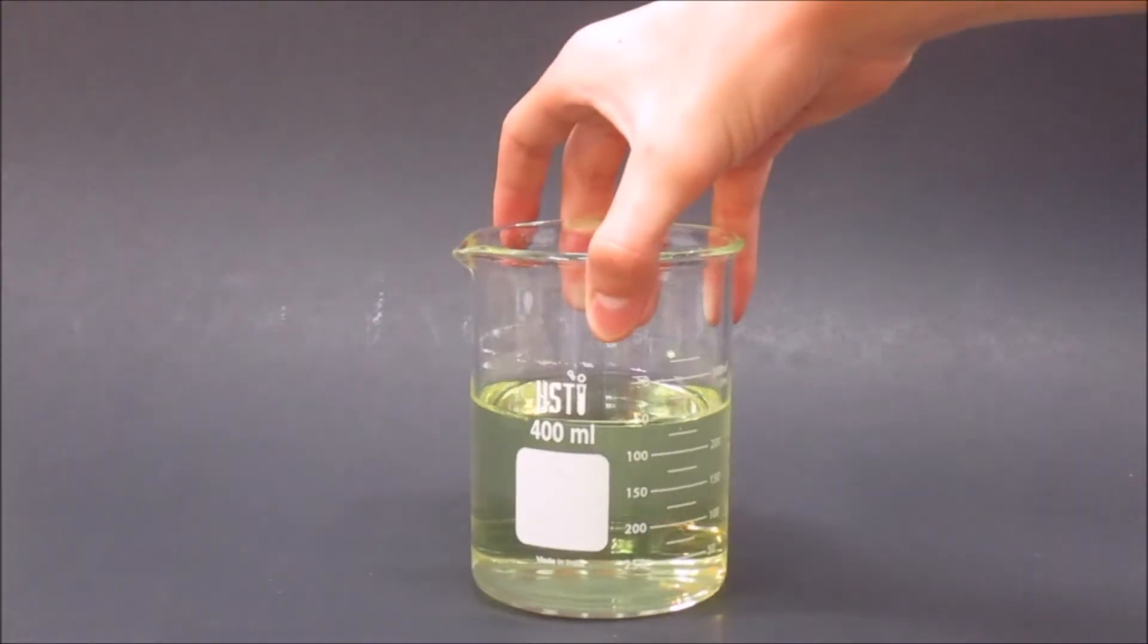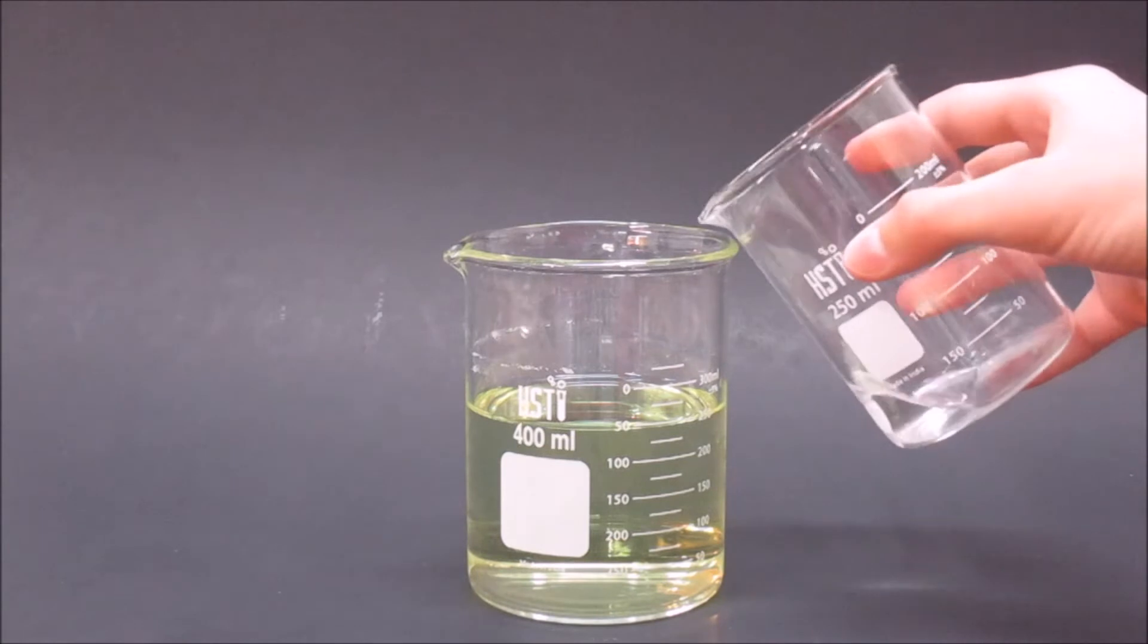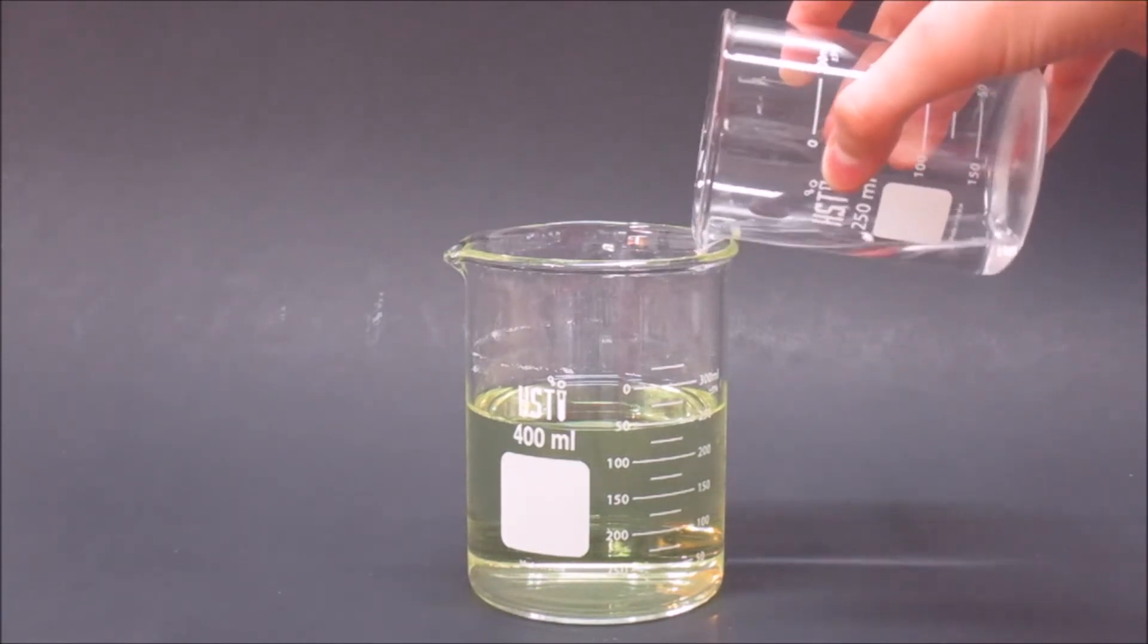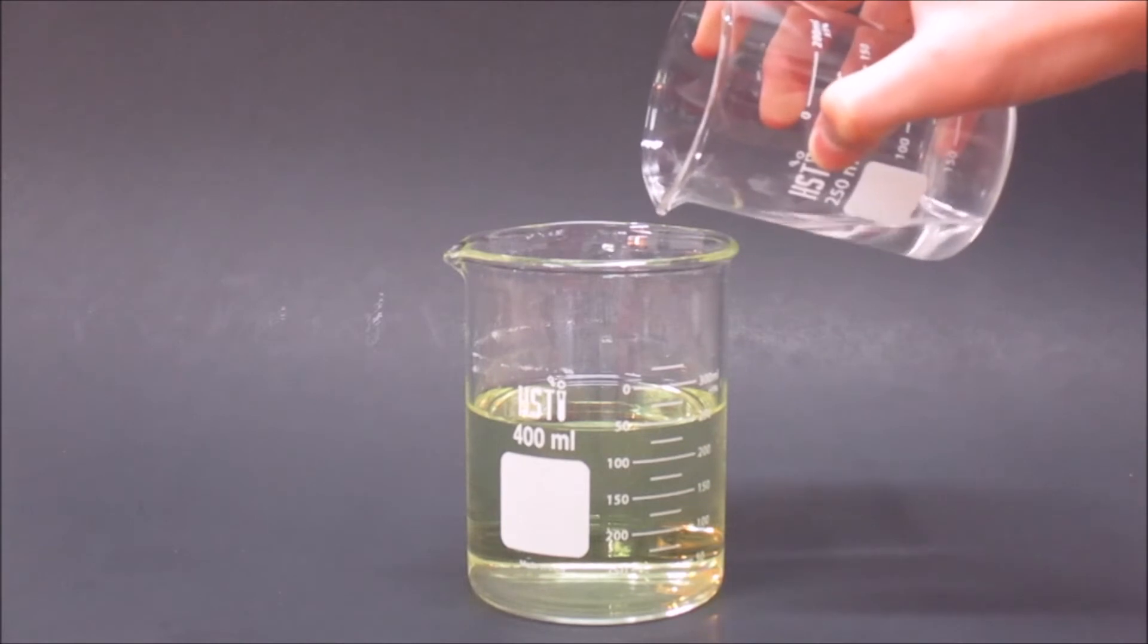I put the beaker with the bleach in the center, and then I poured the acetone into the bleach. I did this slowly so the reaction would not get out of hand.